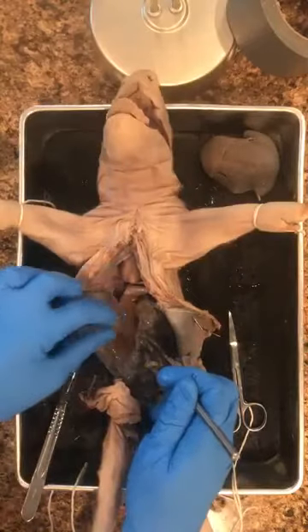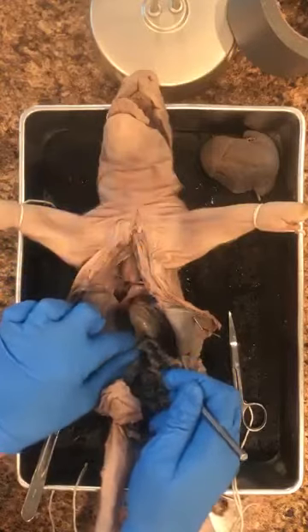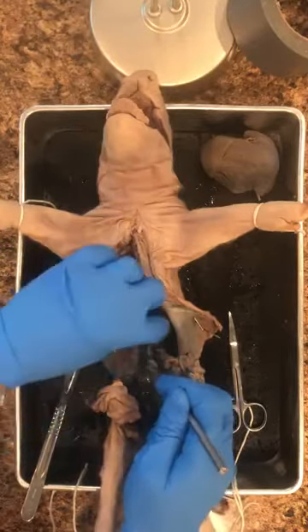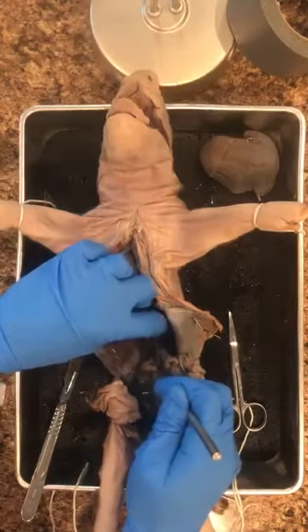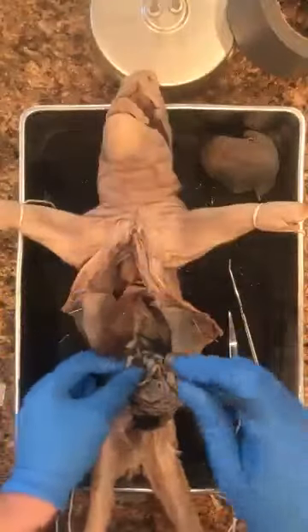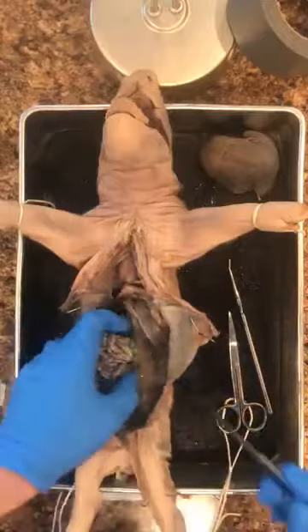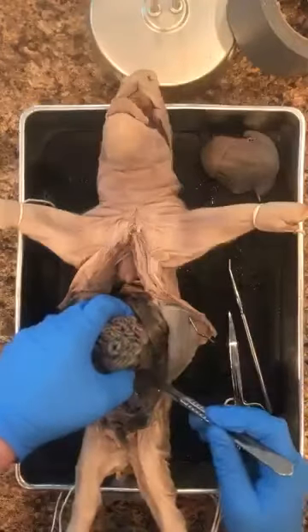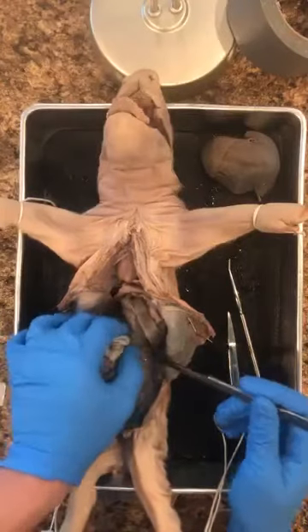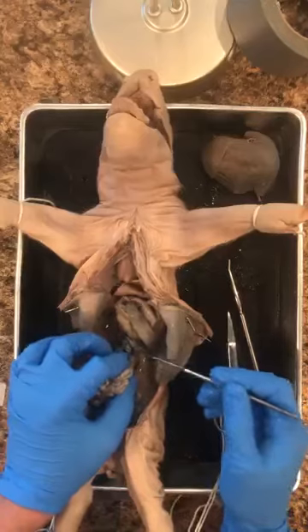Here's the pancreas right here, not up here, that's the spleen. Do you see that? I'll show you another picture soon. It's also very delicate, so I've already ripped part of it as I'm trying to get this intestine removed. Part of it will probably be coming out here.